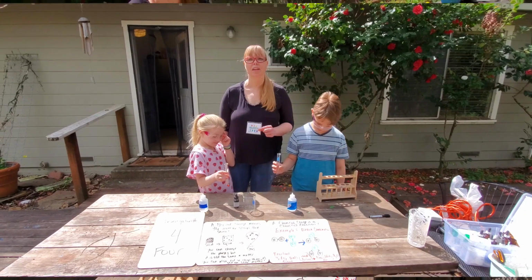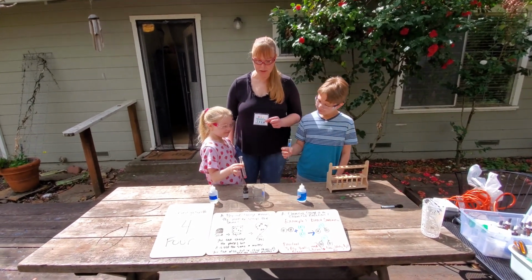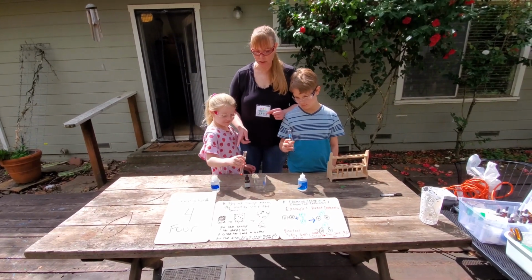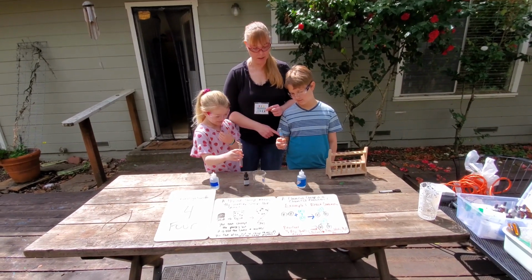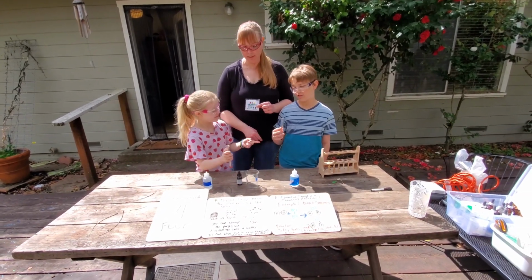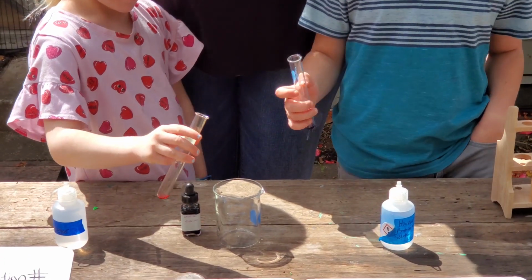Okay, chem students, we're on lab investigation number 4 now. What we're going to do is the same exact thing they had in 3. Jewel has her vinegar, which is pink and acidic. Troy has his blue ammonia Windex, which is a base. They're now going to mix it, and we're going to look at the color to see what happens. Go ahead.